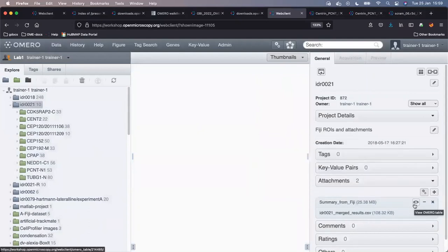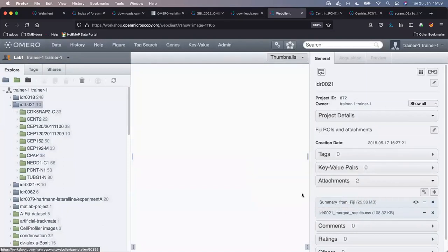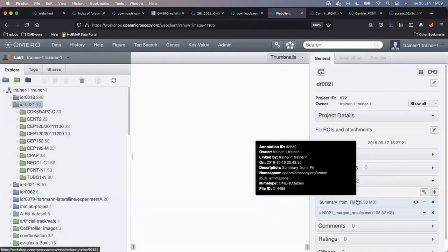This is this flexible structure, Python-based structure for storing of analysis results, as well as for CSV, and we will explore that just after the break.